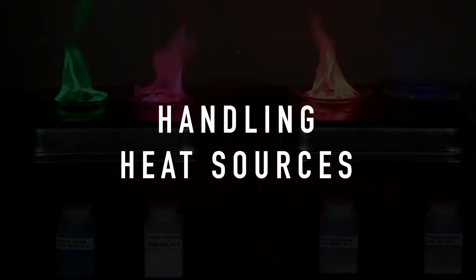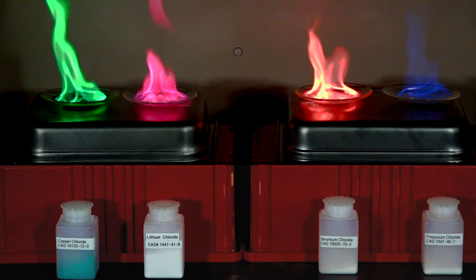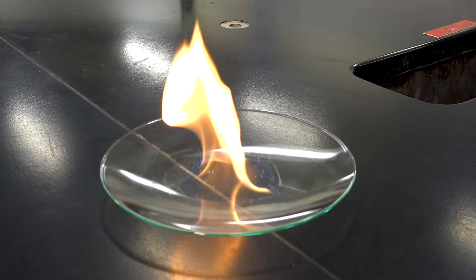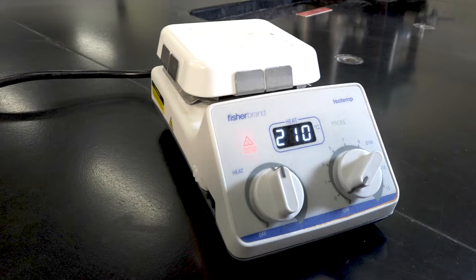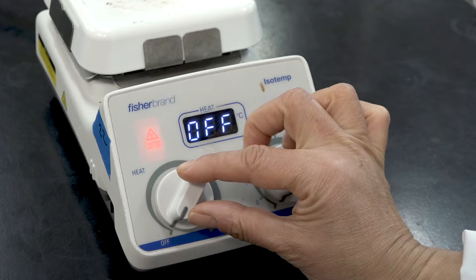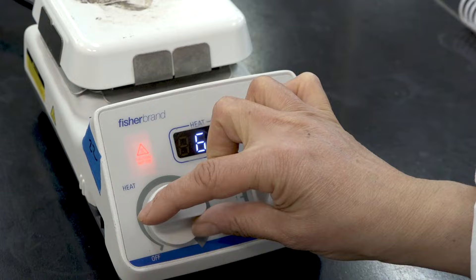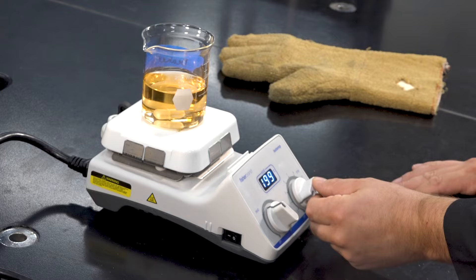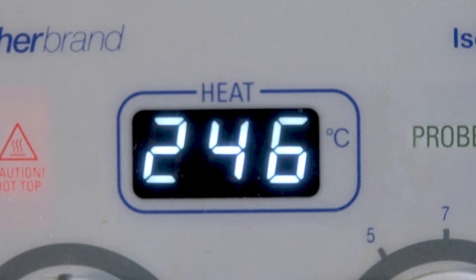Heat is commonly utilized in a chemistry lab in a variety of ways, including catalyzing chemical reactions, isolating compounds, and purifying reaction products. Let's explore the safety hazards of the different heat sources used in a chemistry lab. A hot plate is a common method for providing heat to the various glassware vessels used in a chemistry lab. It works a lot like a stove. There is a knob that increases the temperature of the surface plate. Many hot plates also have a built-in magnetic stirring feature as well. The temperature readings correspond to the surface of the plate. Your sample will generally be much cooler than this surface temperature.